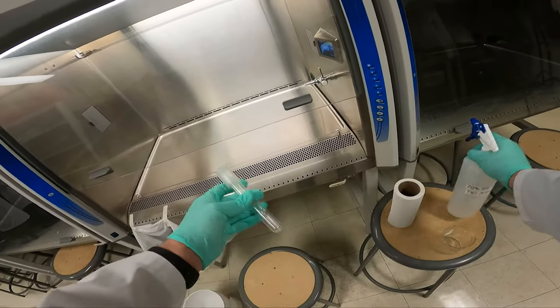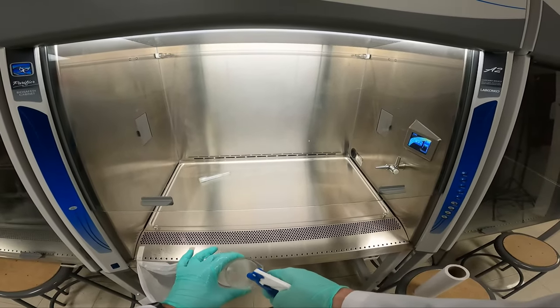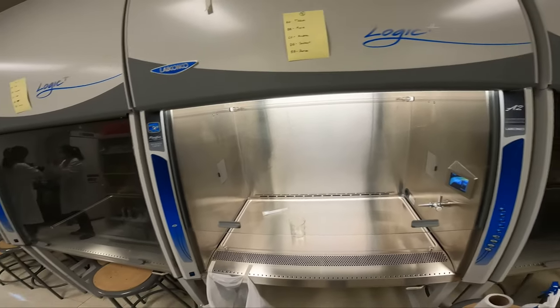Every item that goes inside must be sprayed down with ethanol to sterilize it. So we'll spray it and gently place it inside. Please note: don't spray your items on the main walkway — it'll make the floor very slippery with ethanol and it can cause an accident.